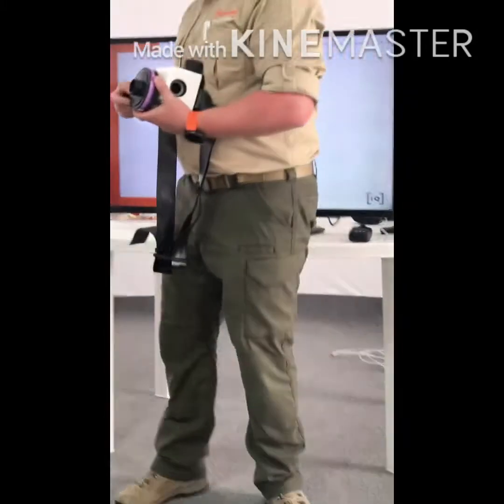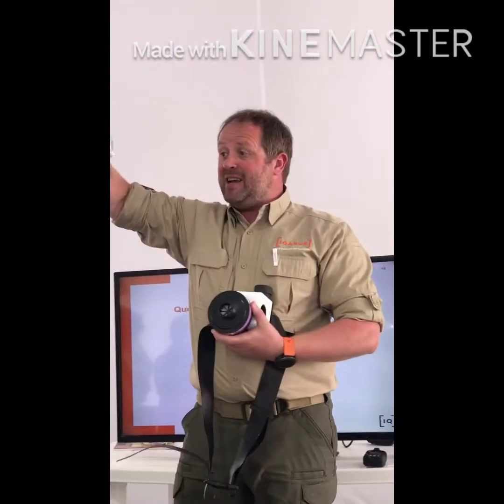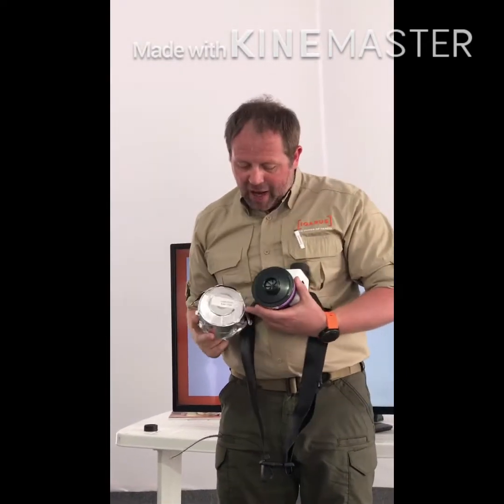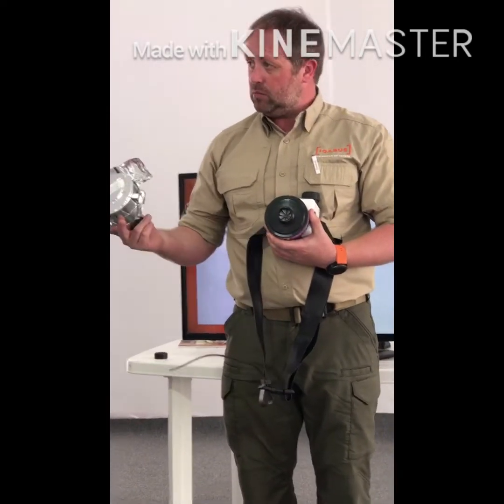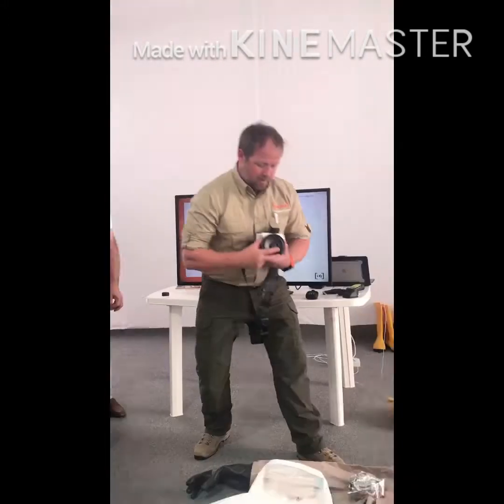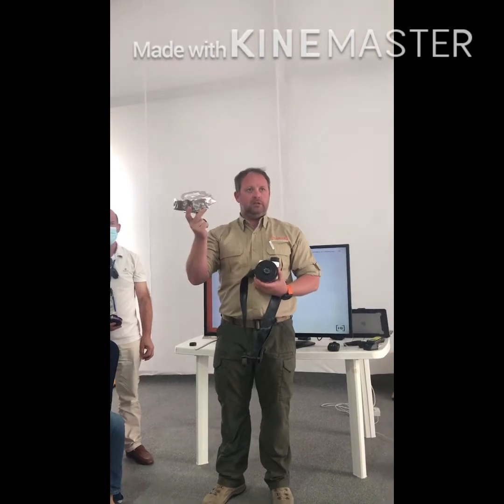Dependent on what scene you are in, will depend on the canister you get. This is a real life one. So what I would expect when I open my bag is to find it looking like that, still in its foil, not opened. I'm going to check my expiry date, make sure it's in date, just like drugs. Okay? And I'd make sure that it's completely sealed, because otherwise you don't know where it's been. Okay? We don't open these for training because they're around £500 each, just for one canister. Okay?